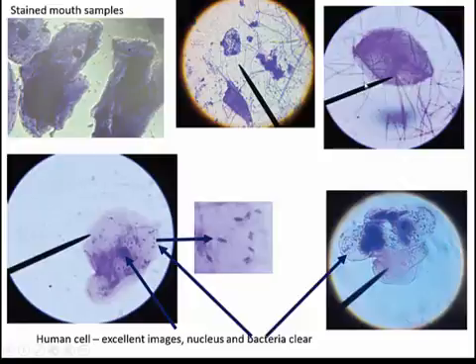And if we look at this one up close, we can see more fibers, right? And then here's a human cell, and in the middle is a nucleus. So it's pretty good.